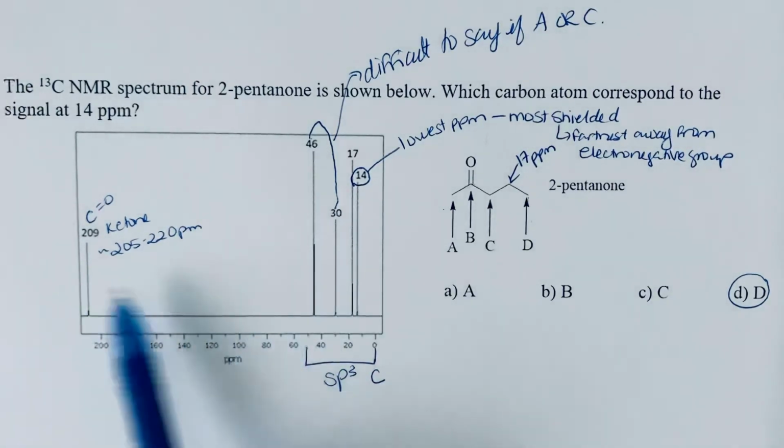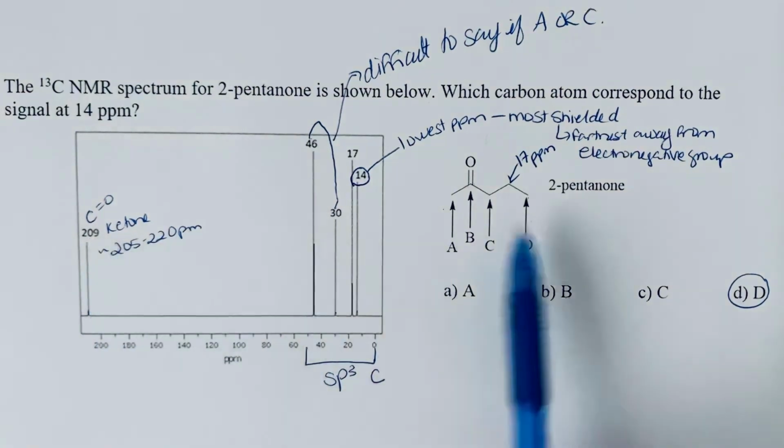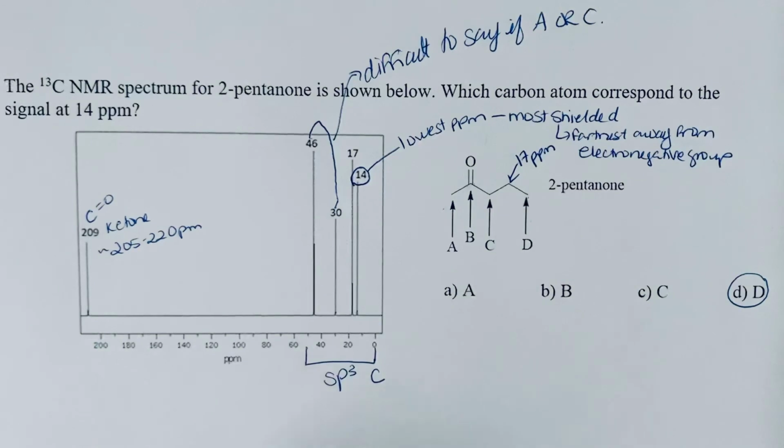So from a spectrum like this, I would expect that you'd be able to easily identify that ketone, or maybe the carbon at the very end of the chain that has that lowest chemical shift value. And those would be reasonable questions to ask at this level.